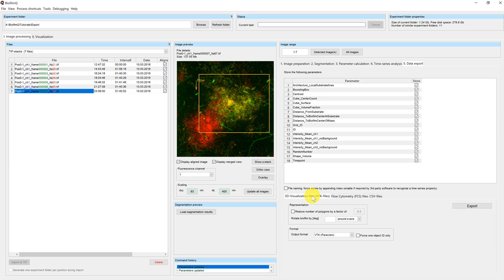Let's focus first on the 3D visualization files. At the bottom you can decide which output format you want to use. You can use either the VTK format, which can be visualized by the 3D rendering software Paraview, or you can pick the STL format, which is a default exchange format for CAD files. You can find a list of programs which support this file format on Wikipedia, for example.